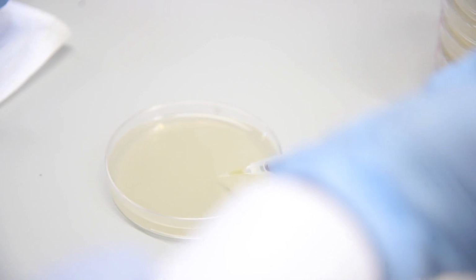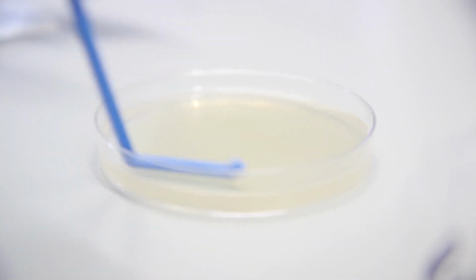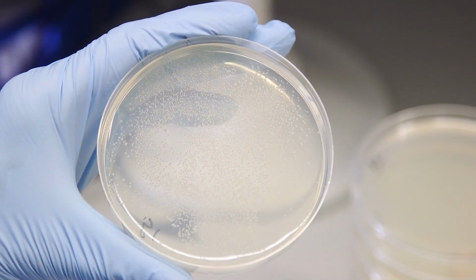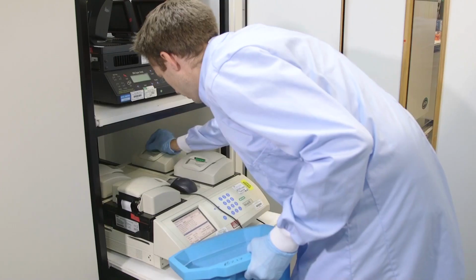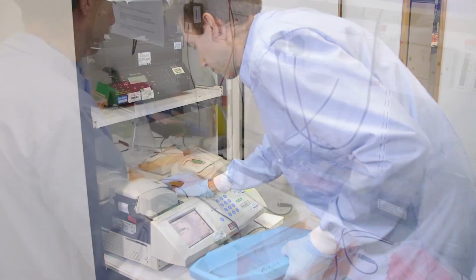The modified plasmid is put back into bacteria using electroporation again and then plated up. Once the bacteria have grown on the plates, we pick the colonies and culture them overnight. As a first quality control step, we run another PCR reaction to confirm that the genomic fragment is correctly modified.